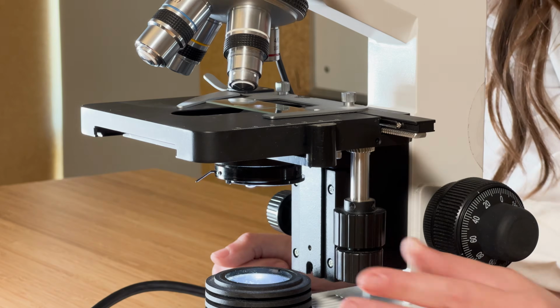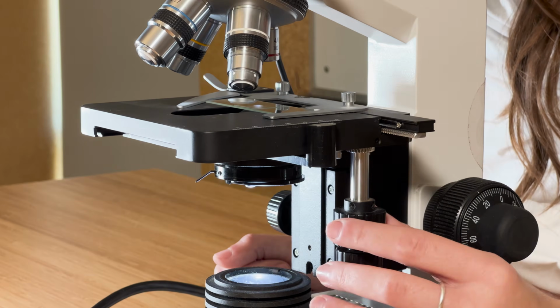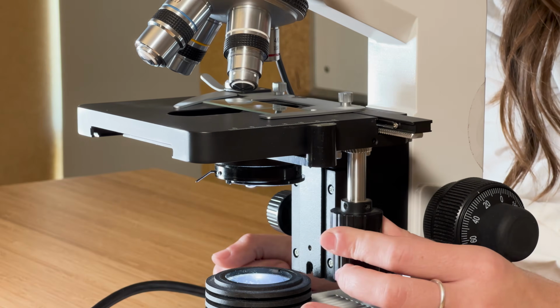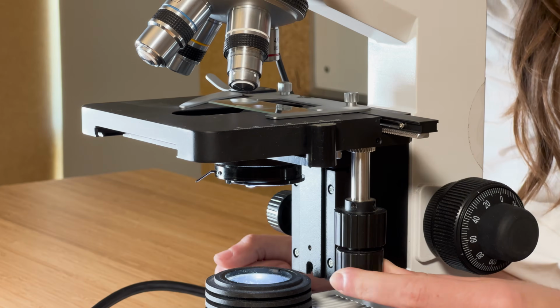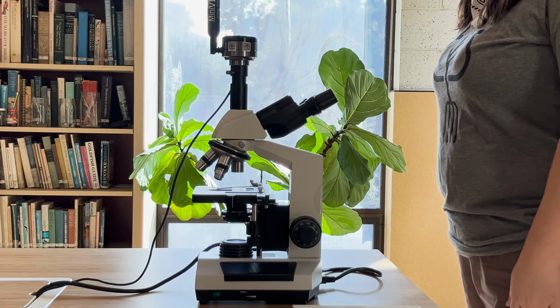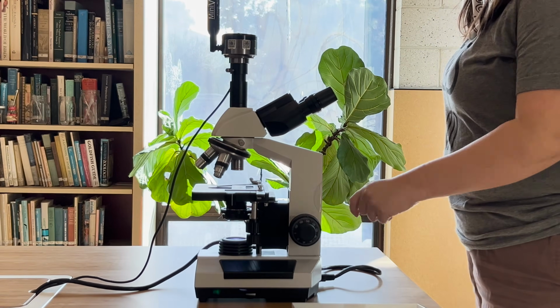You can adjust the slide position with the knobs under the stage, known as the XY axis controls. The top dial moves your stage and sample when viewing vertically along a y-axis, while the bottom dial moves it horizontally along an x-axis. There are two levels of focus on the microscope, a coarse focus and a fine focus.